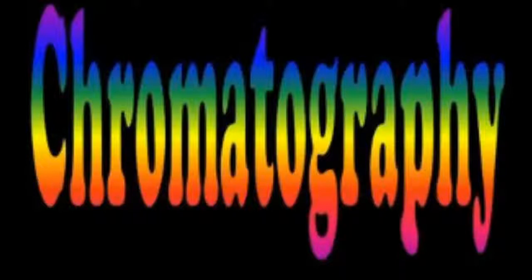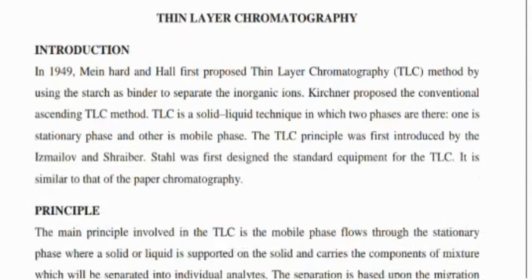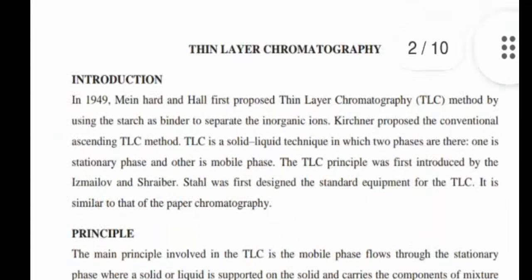So today we come with another new and interesting topic of chromatography, which is a type of chromatography: thin layer chromatography. It is also known as TLC. So let's start. What is TLC and what is thin layer chromatography?